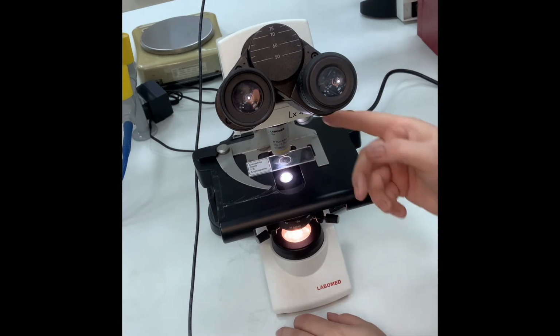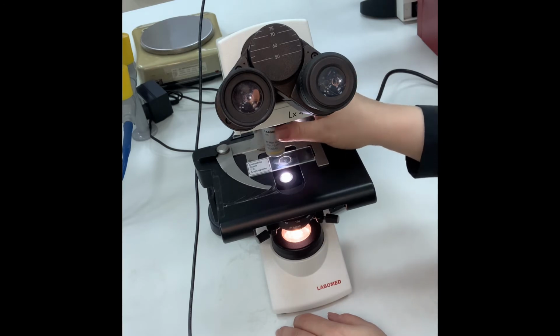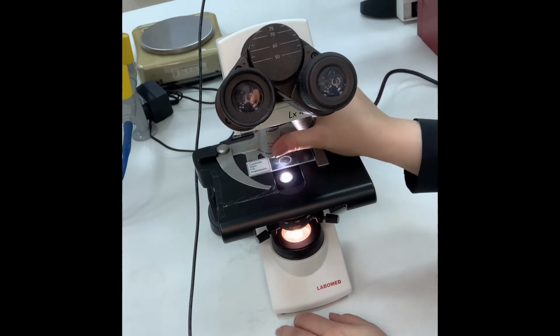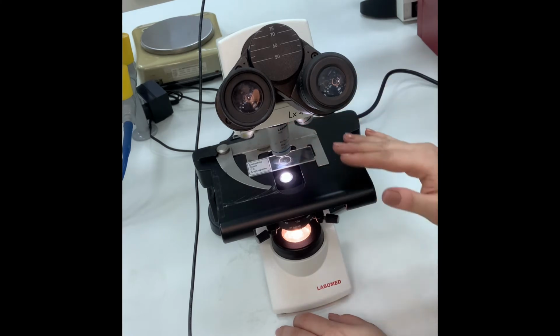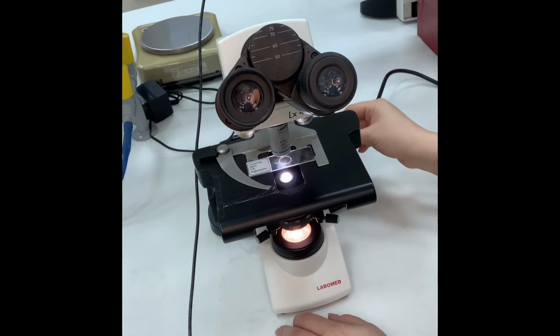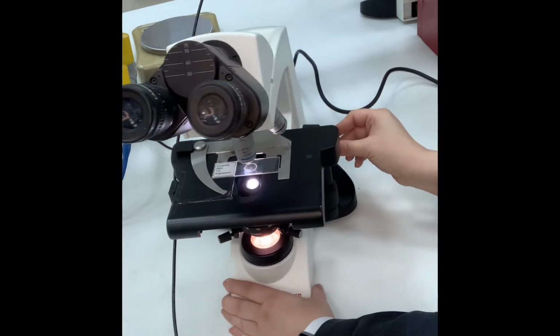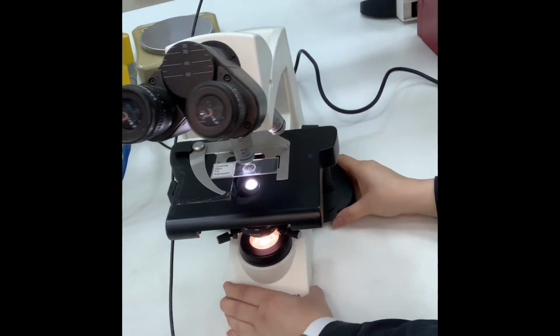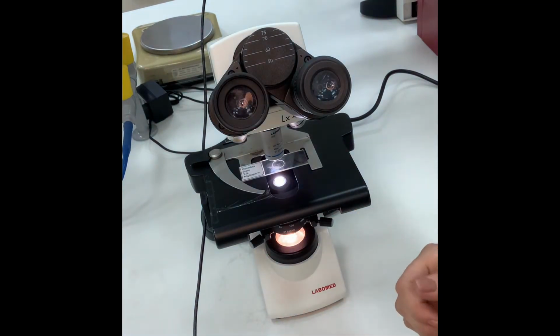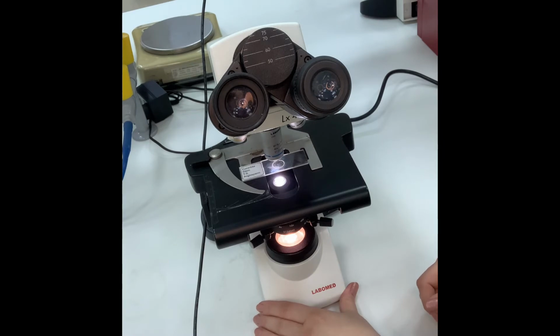All you have to do is to pull the revolving nose piece and change it into a 10, into a 40, very freely. All you have to do is to sharpen the image by using the fine focus, the small knob over here, because once you go deeper, it sometimes becomes foggy, so you will just have to focus it.